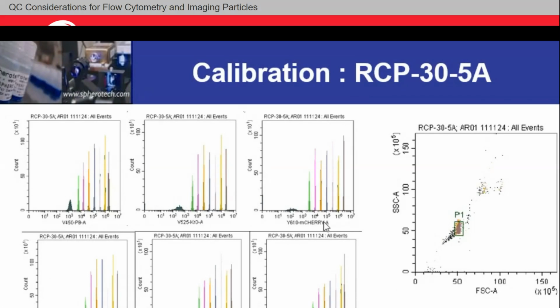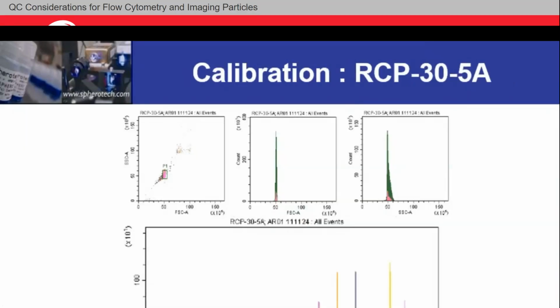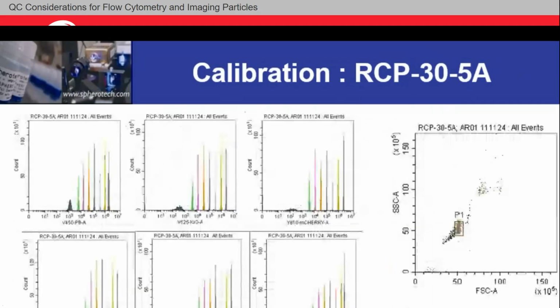So the first time I run almost anything, I color-code it because that's personally what I like to do. You can look at various other things. Maybe you understand, oh, the dynamic range is 1024. So if I see one of these MFI values that exceeds, like this is 87167534, maybe if this goes beyond what you know is the highest limit for this dynamic range, maybe you're number oriented in that way. I go visual orientation.